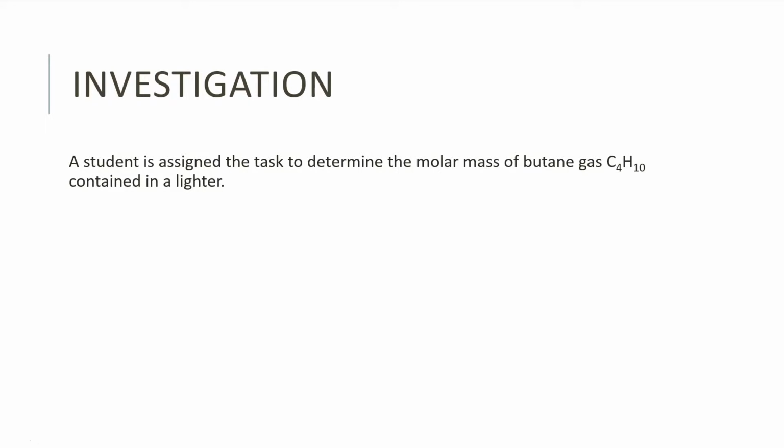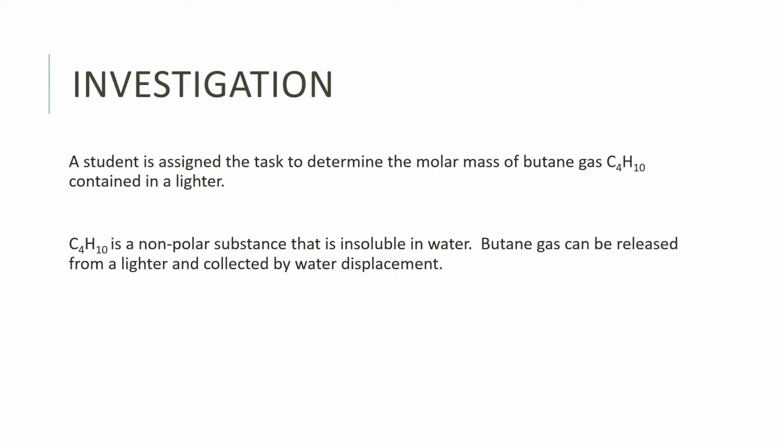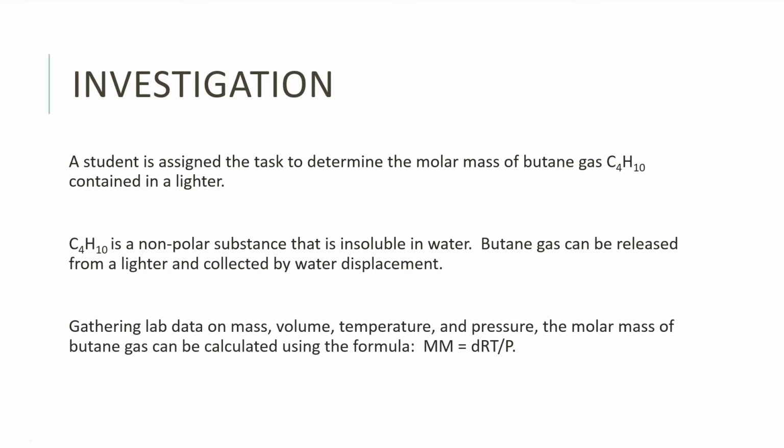Investigation. In this lab, a student is assigned the task to determine the molar mass of butane gas contained in a lighter. Butane is a nonpolar substance that is insoluble in water. Because of this, the butane gas can be collected by water displacement by releasing it from the lighter.